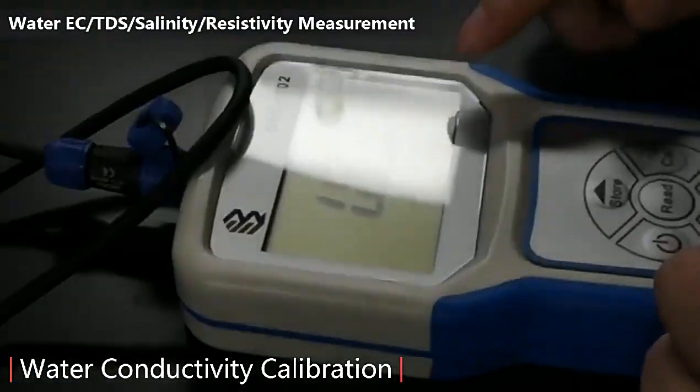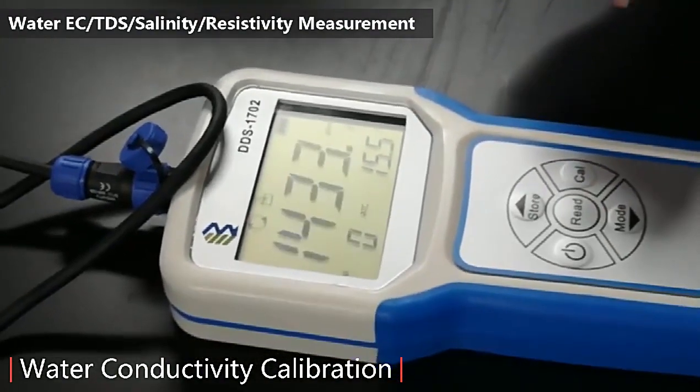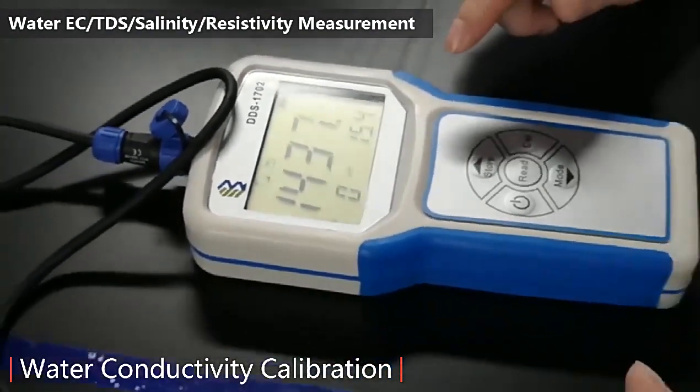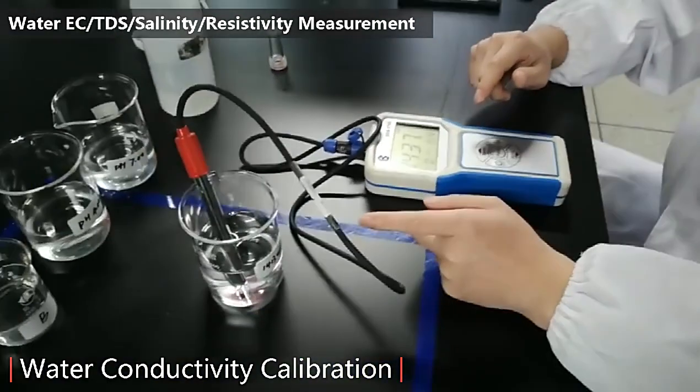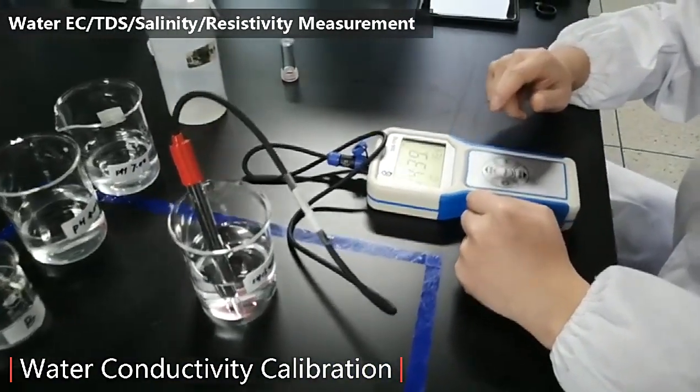As you can see, calibration is done. We are back to the screen. This is the real value and you can see buffer 1413 — reading 1439, stable.